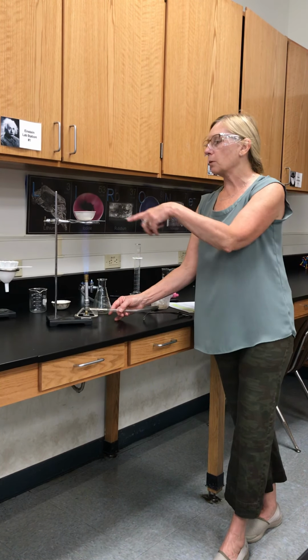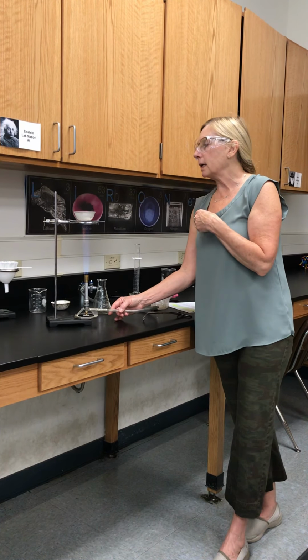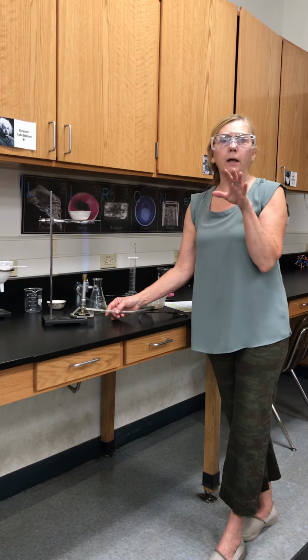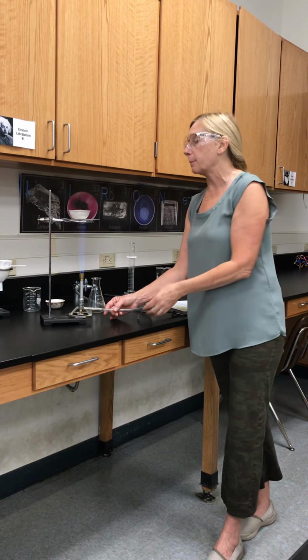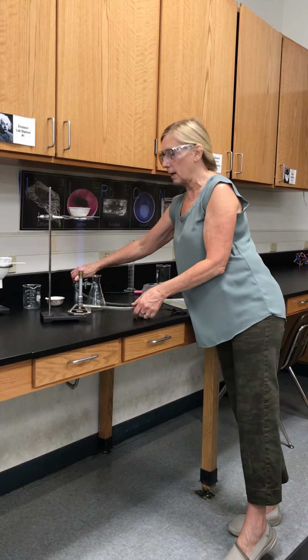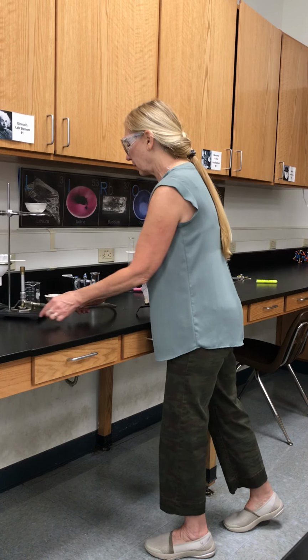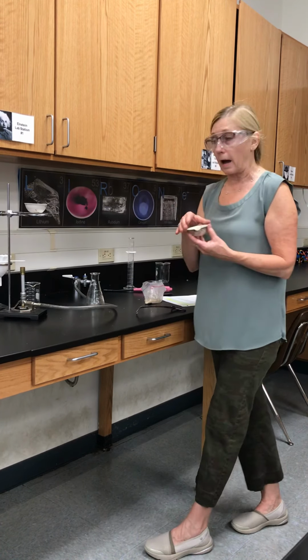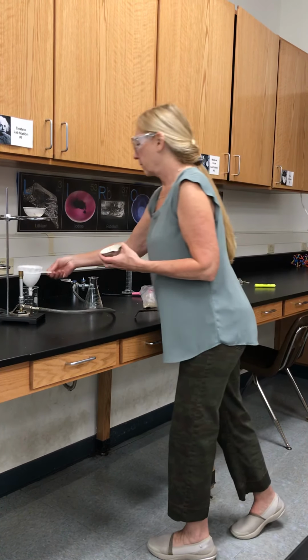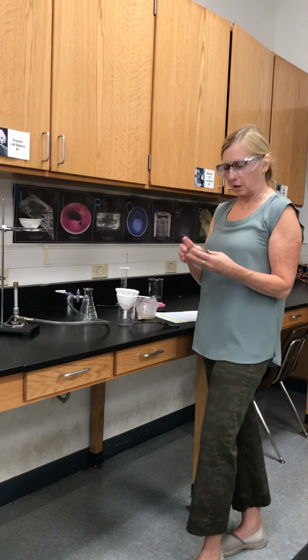What we're going to do is heat up this liquid. So we're heating it up and we're going to keep it going. Pretty soon it's going to start boiling and the liquid is going to disappear. So fast forward, I'm going to pretend that's already happened, so I'm going to turn this off. This would be the outcome afterwards. It's kind of like one of those cooking things on Facebook, where they just tap it with the spatula and it goes right away.